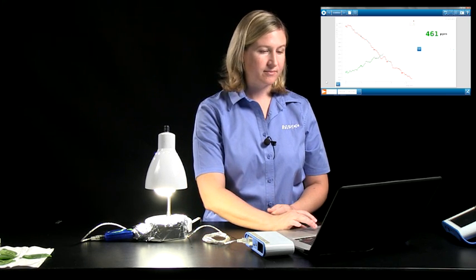Once data collection is complete, we can use the graph tools to be able to analyze our data. Again, for the purposes of today's presentation, we'll stop data collection before the time period you would traditionally go for in this lab.